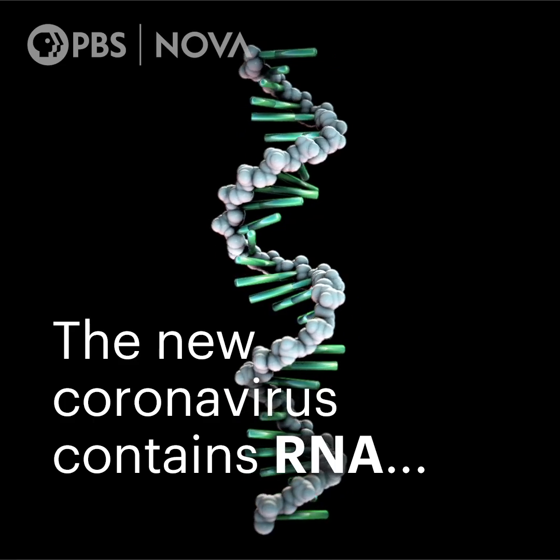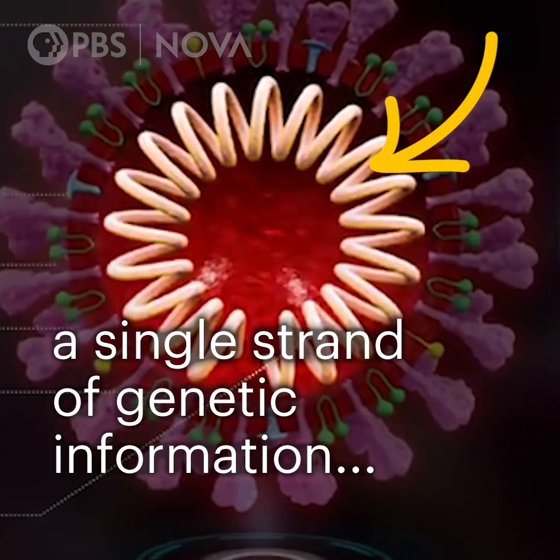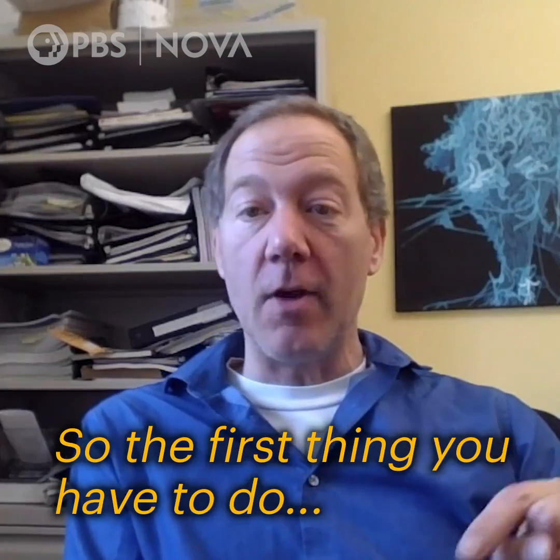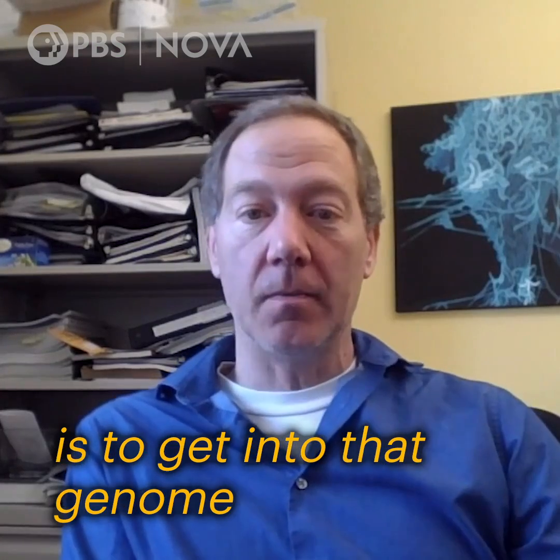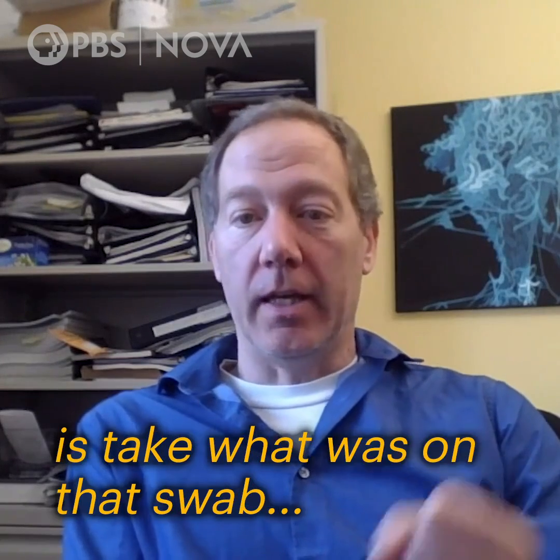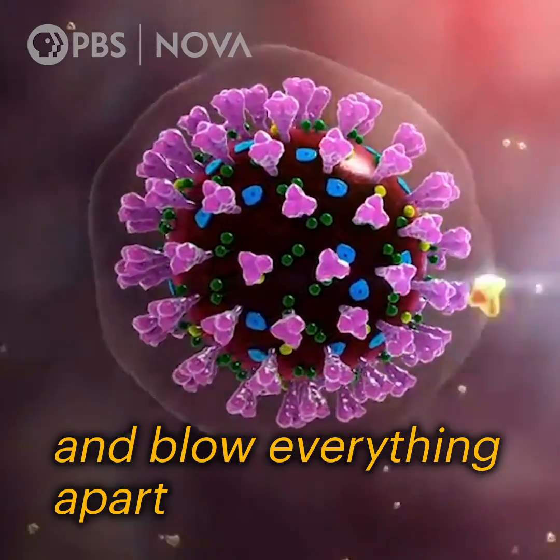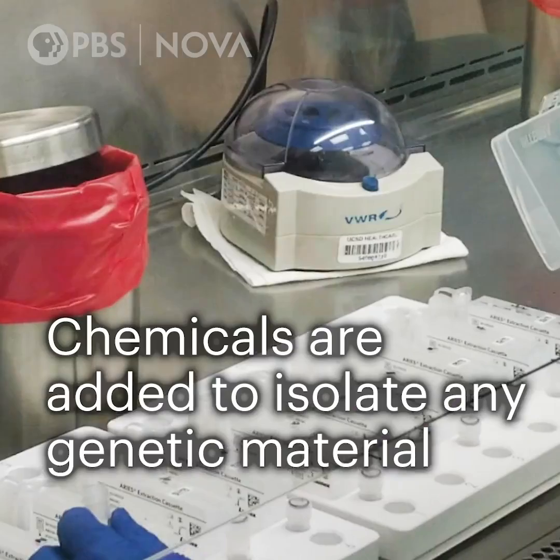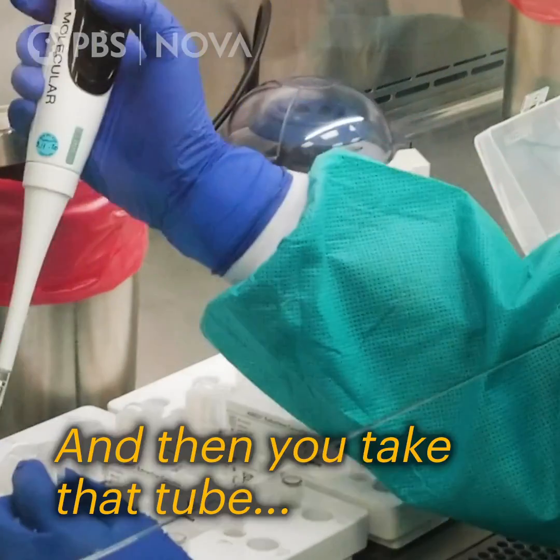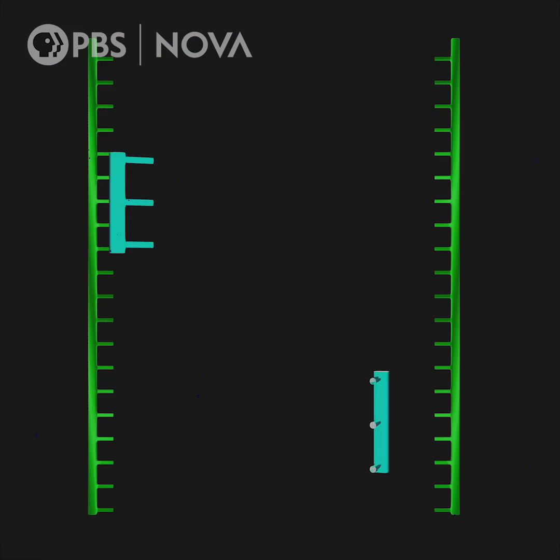The new coronavirus contains RNA, a single strand of genetic information that sits inside a spherical casing. So the first thing you have to do is to get into that genome. So after the swab, what you will then do is take what was on that swab and blow everything apart. Chemicals are added to isolate any genetic material. And then you take that tube and you subject it to a PCR.